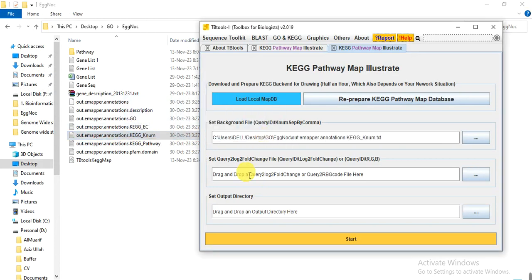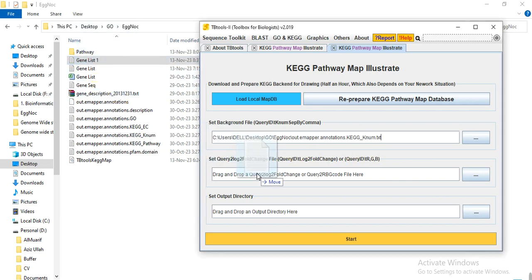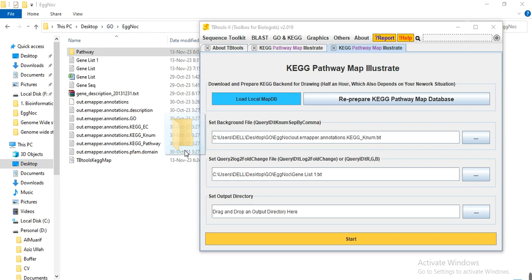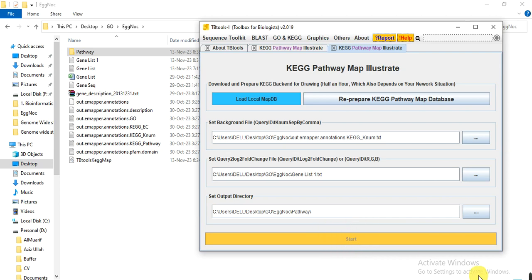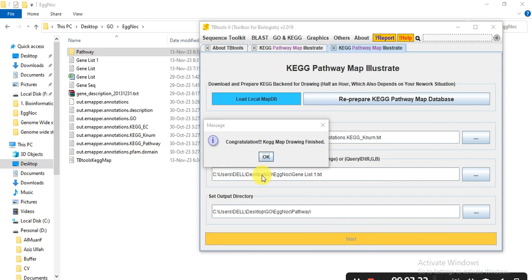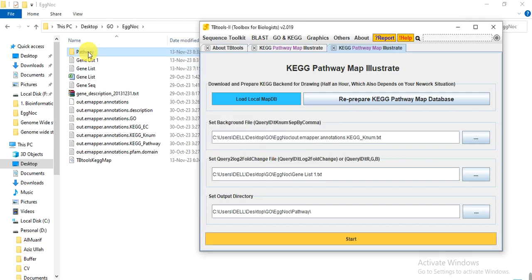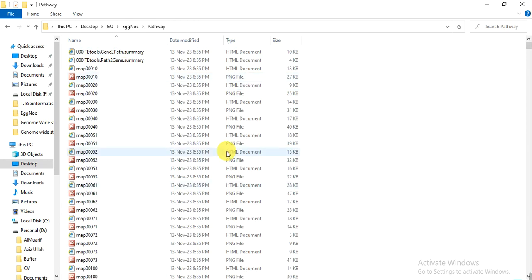Drag the file here. You can give the gene list with expression data or with a color name, as we made just now — this one is the gene list in which we gave the blue color. Here you can give the directory where you want to save your pathways; I made a folder called 'pathway'. Then click Start. The color is light while processing, but when it finishes the color becomes bright. When the analysis finishes, you will receive the message: congratulations, KEGG map drawing finish. Click OK.